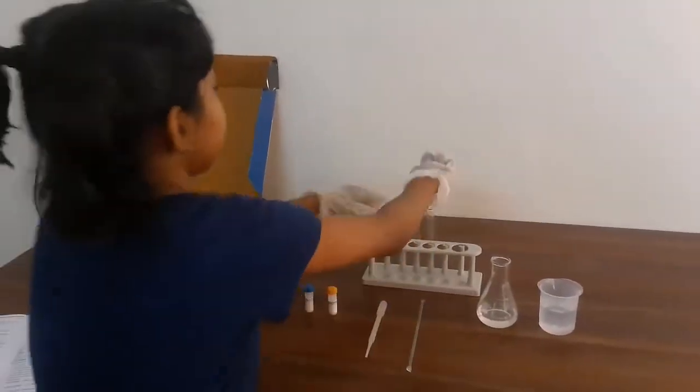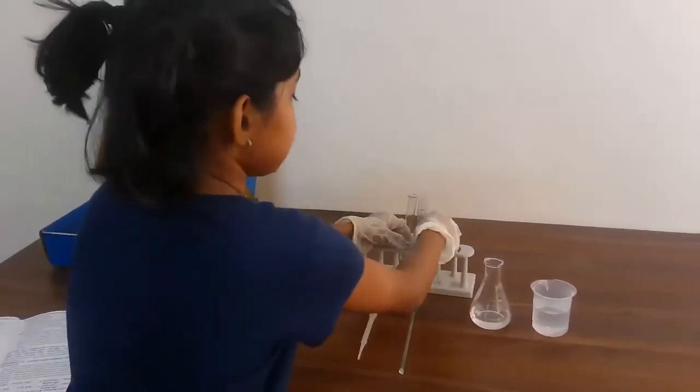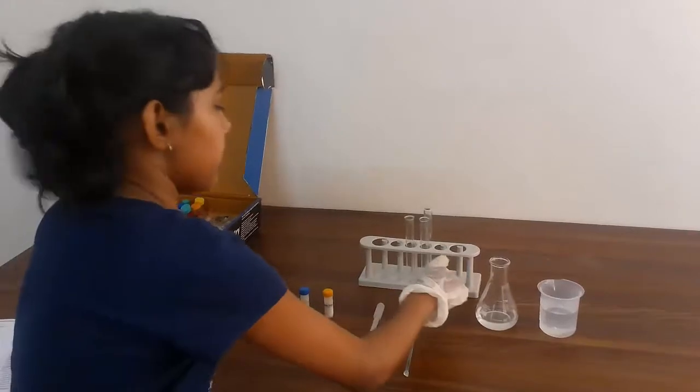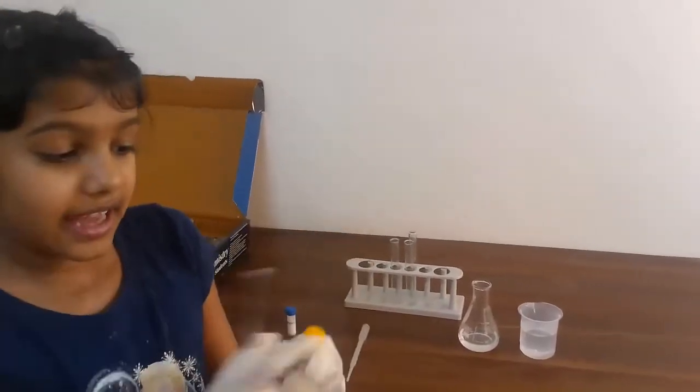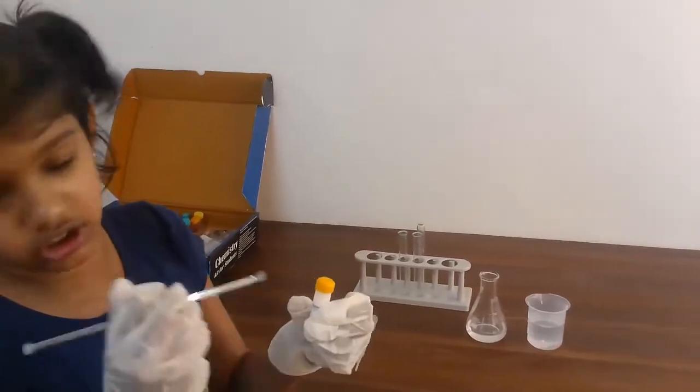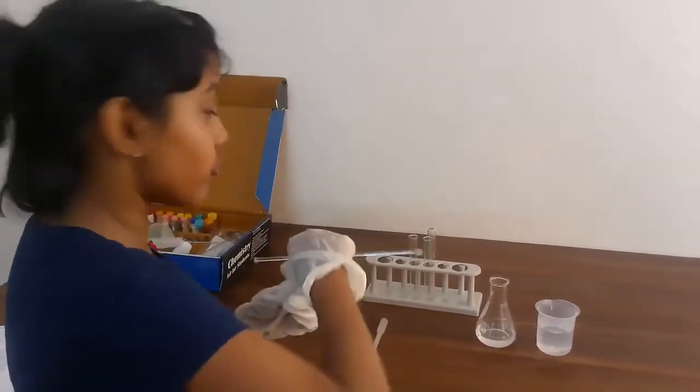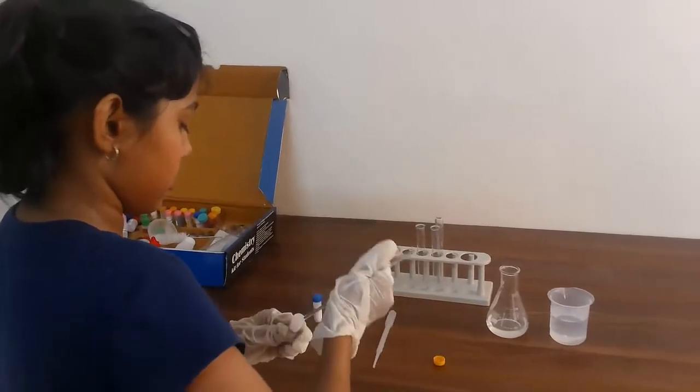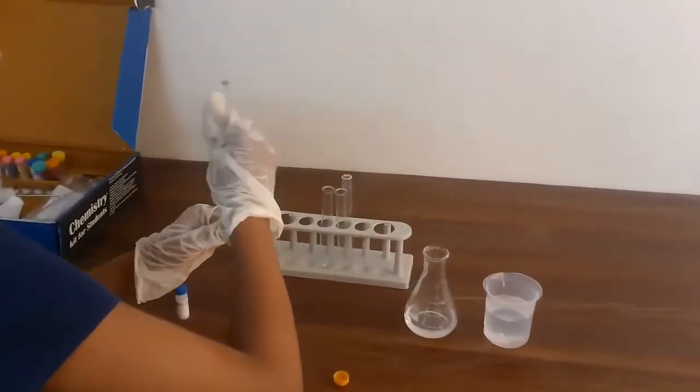So the first step will be to put two test tubes inside the object you're going to be keeping the test tubes in. Then take your spatula and take three spatulas of calcium chloride and keep it inside one test tube. Make sure you remember which test tube you're keeping it inside of.